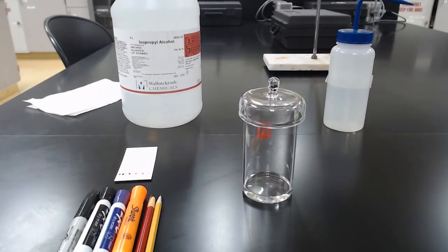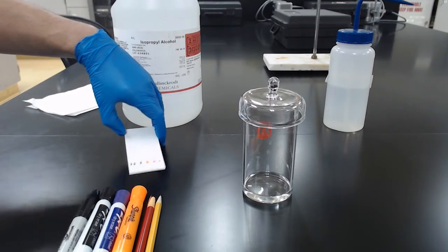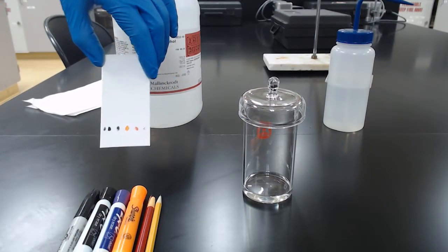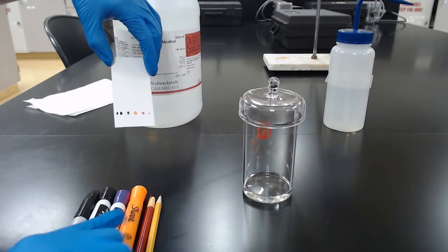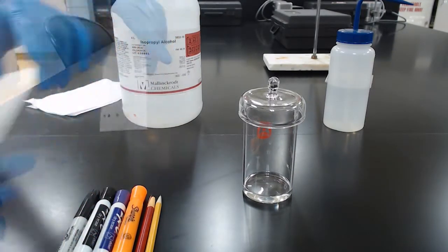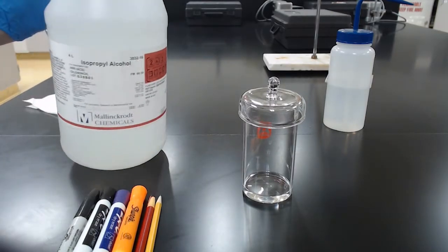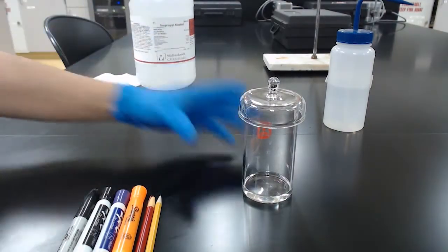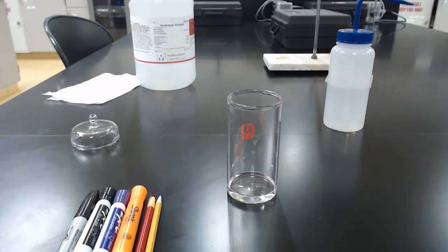Okay, we're about ready to go here. Just to reiterate, we have all these different writing utensils, and I spotted our TLC plate with some of each. I actually lined them up here in the order that they are on the plate. And for our solvent, we are going to be using isopropyl alcohol, common name rubbing alcohol. So all we do is set it in here and wait. And I will time lapse this part, don't worry.